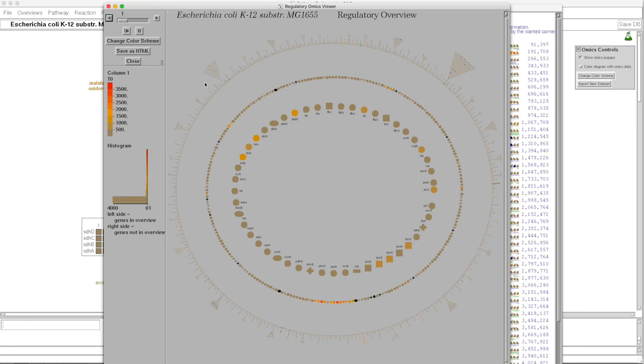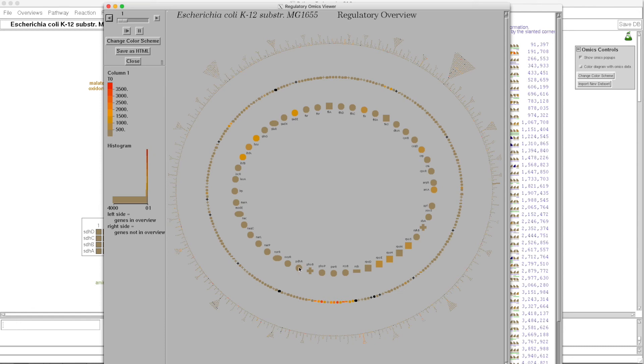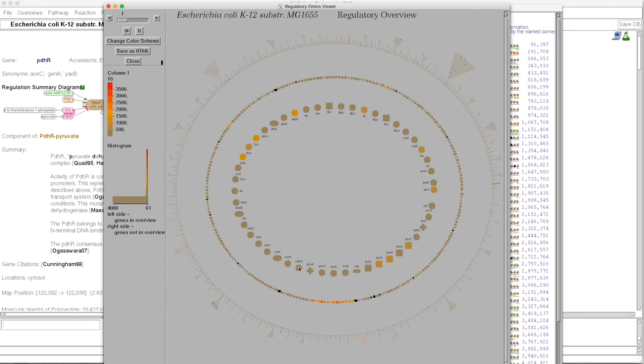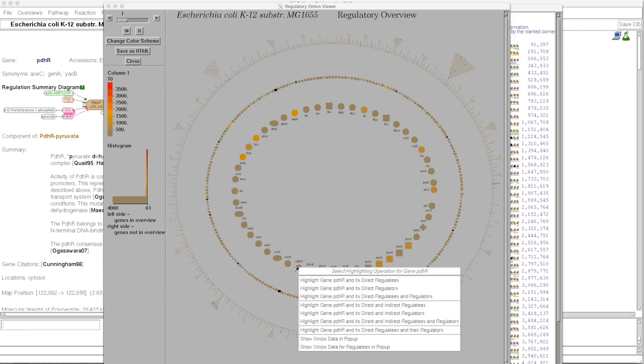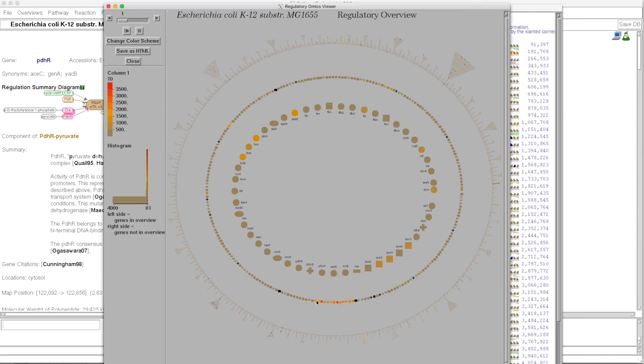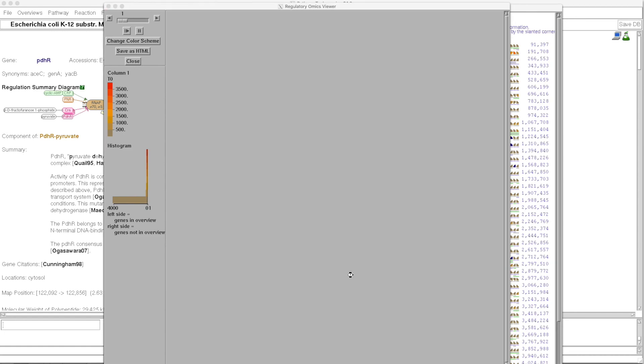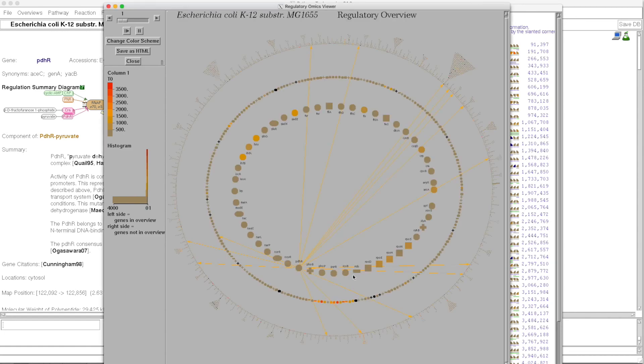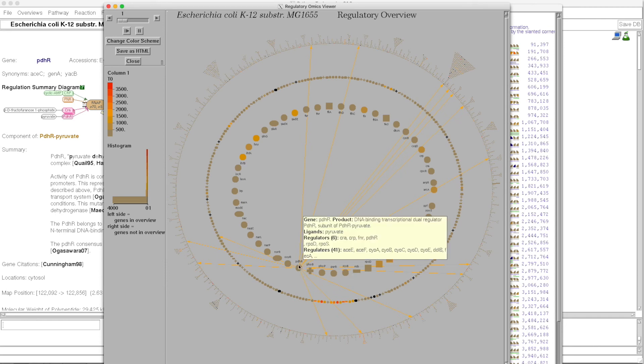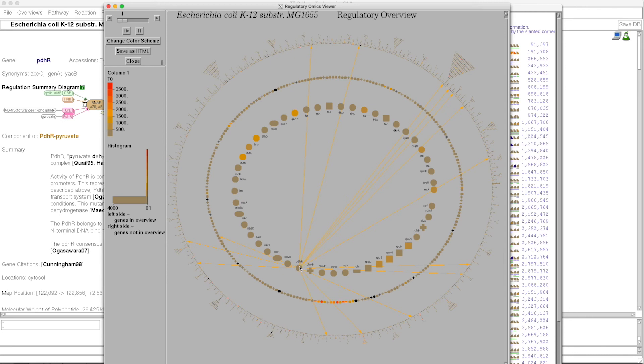Another tool is the regulatory overview diagram, which in this case highlights the same gene expression data set onto a regulatory network viewer for E. coli. And I can click on a gene to highlight all the genes that it regulates. And so this diagram lets us compare the behaviors of individual regulators with the behavior of the genes they regulate.